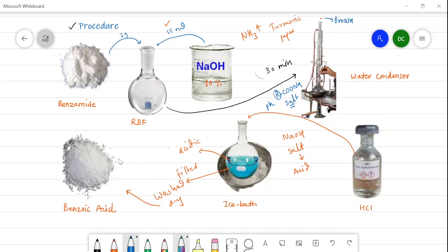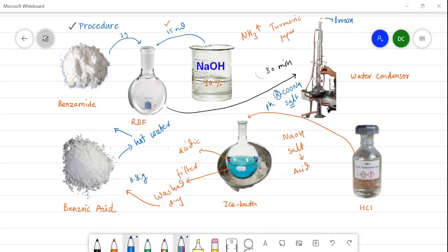This crude benzoic acid is recrystallized from hot water to get a pure product, which is then used for determination of the melting point. The weight of the product is found to be 0.8 grams, and the melting point of the recrystallized product is approximately 122 degrees Celsius.